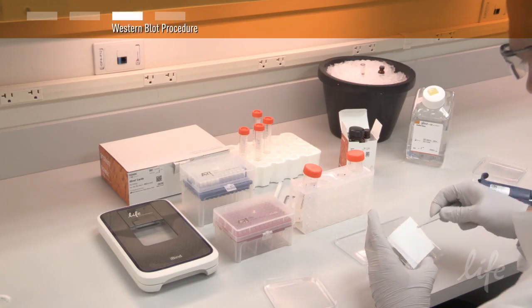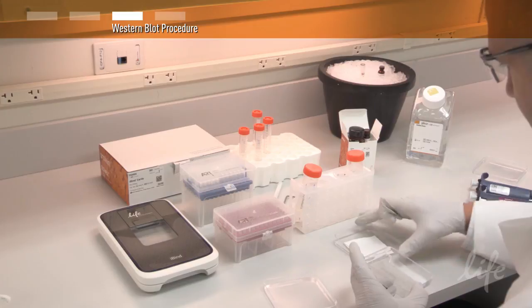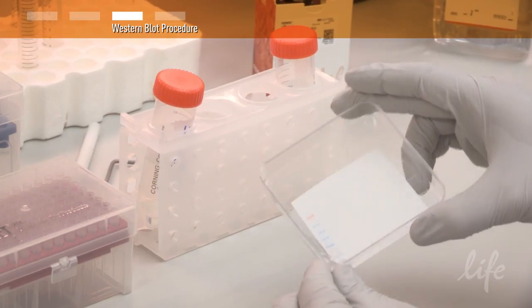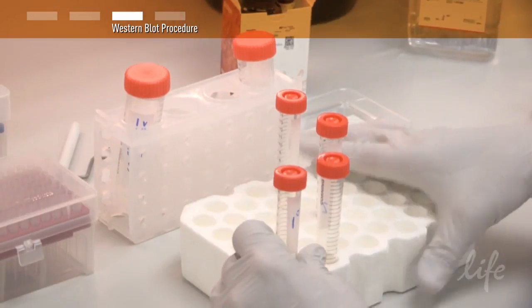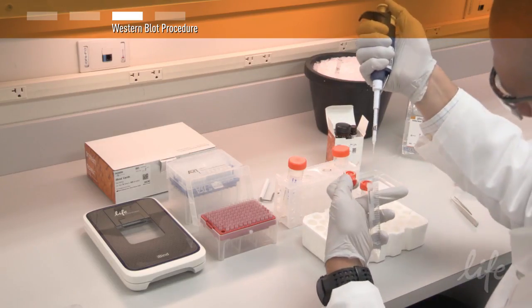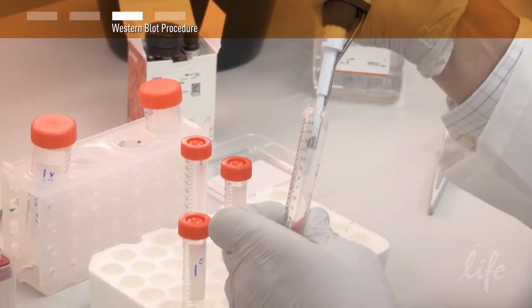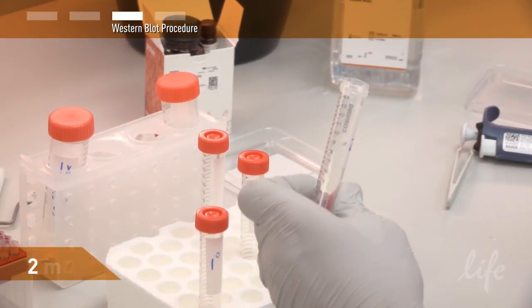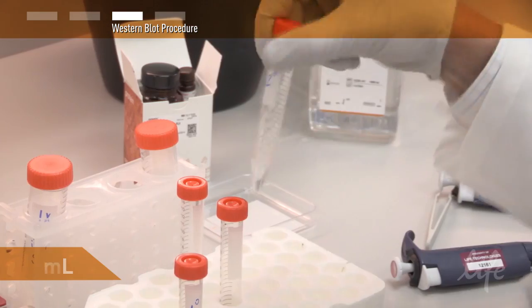To prepare the run, immerse your blotted membrane in 5 milliliters of the 1X iBind solution. Next, dilute your antibodies with the 1X iBind solution according to the protocol recommendations to a total volume of 2 milliliters for both the primary and secondary antibodies.